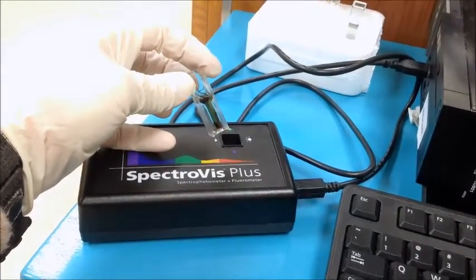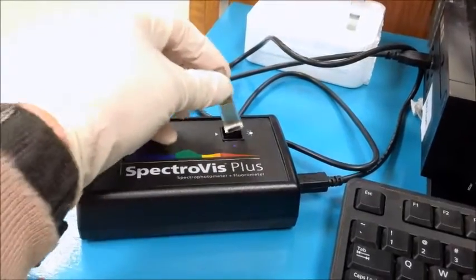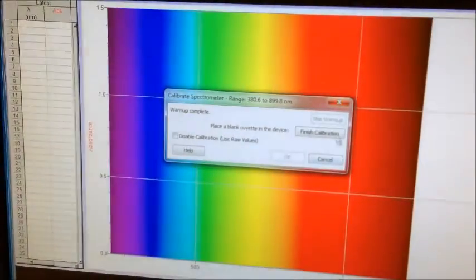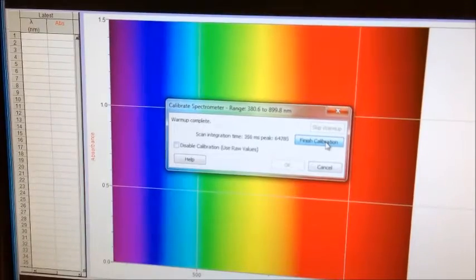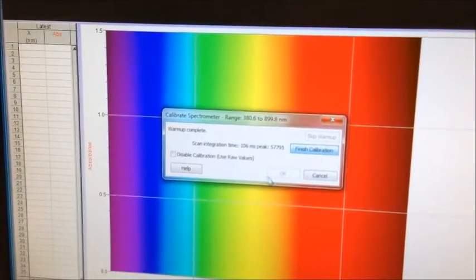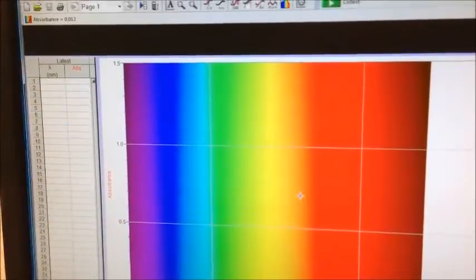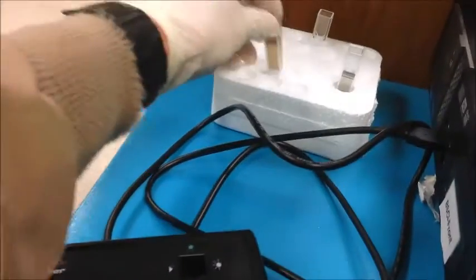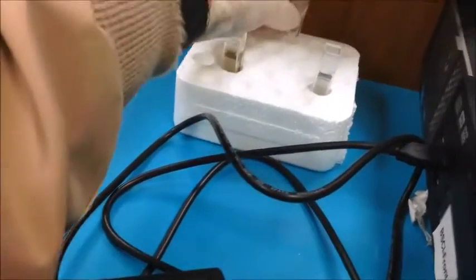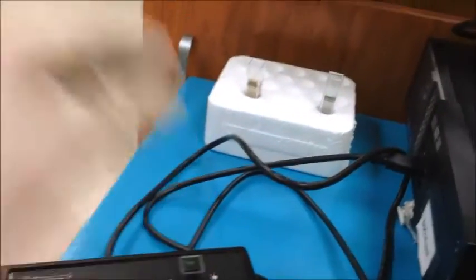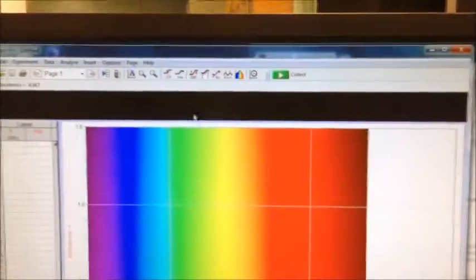Alright, I'm going to conduct another bad experiment. Once again, I'm going to put my Bradford reagent blank in there. I'm going to tell it to finish the calibration. But this time, instead of using the sample of any sort, I'm going to put an empty cuvette in there that has nothing in it at all but air. Let's see what happens this time.